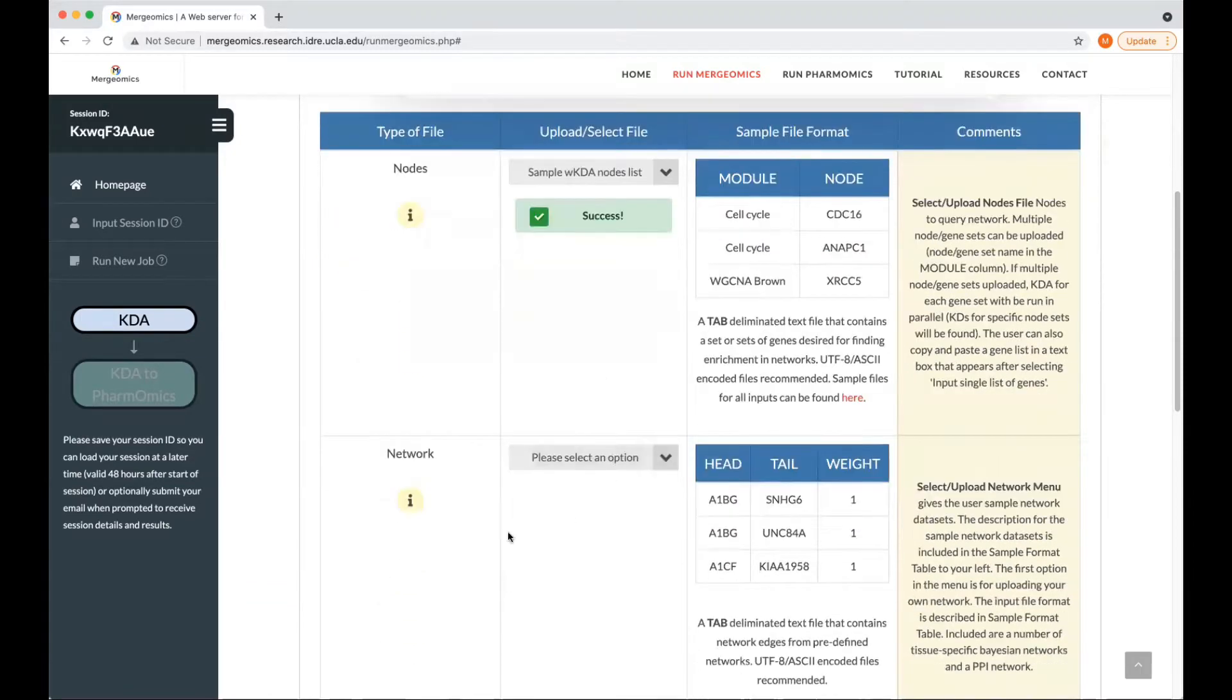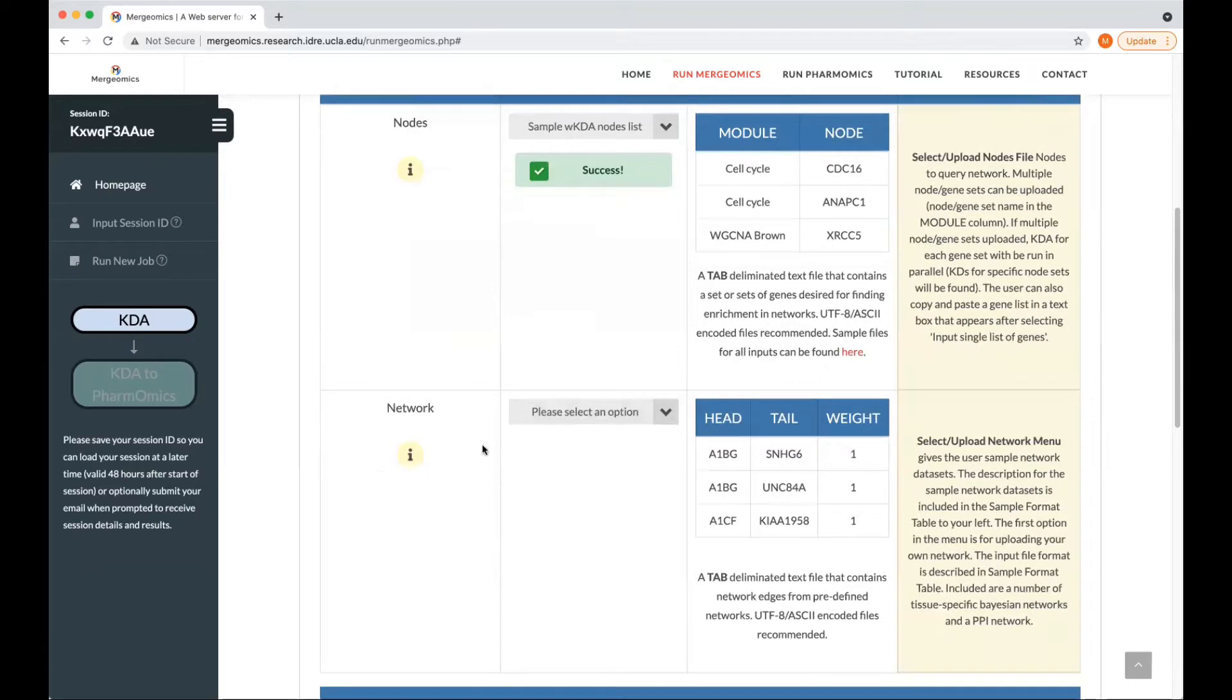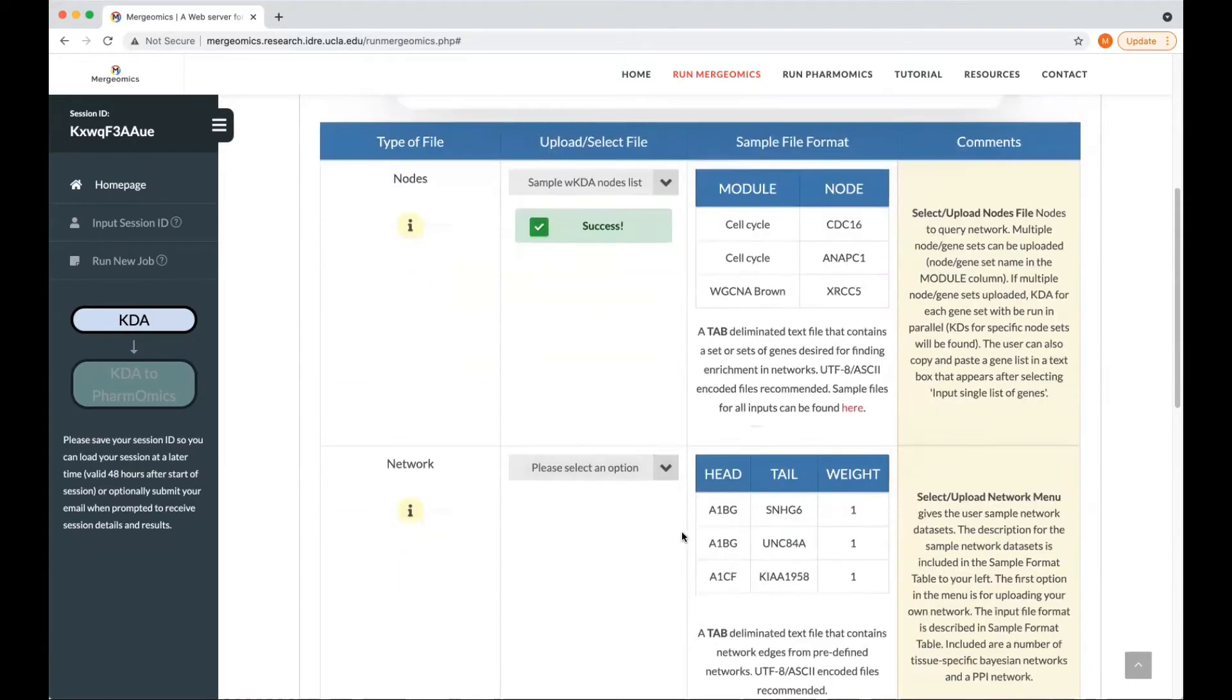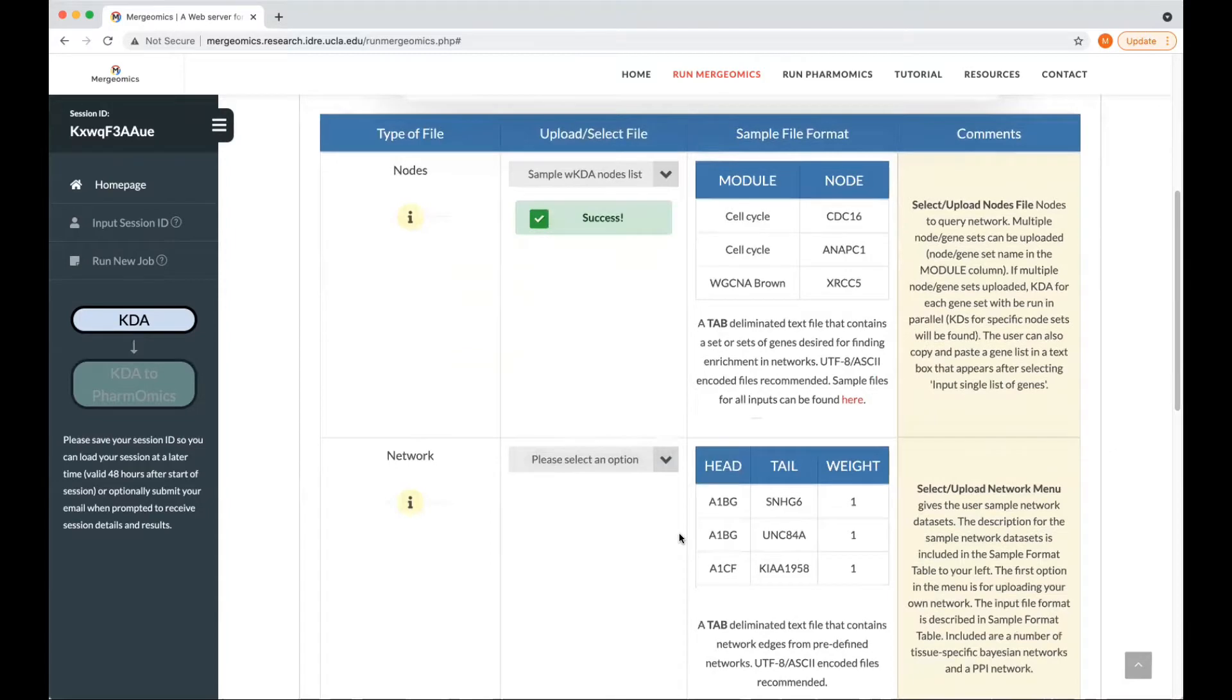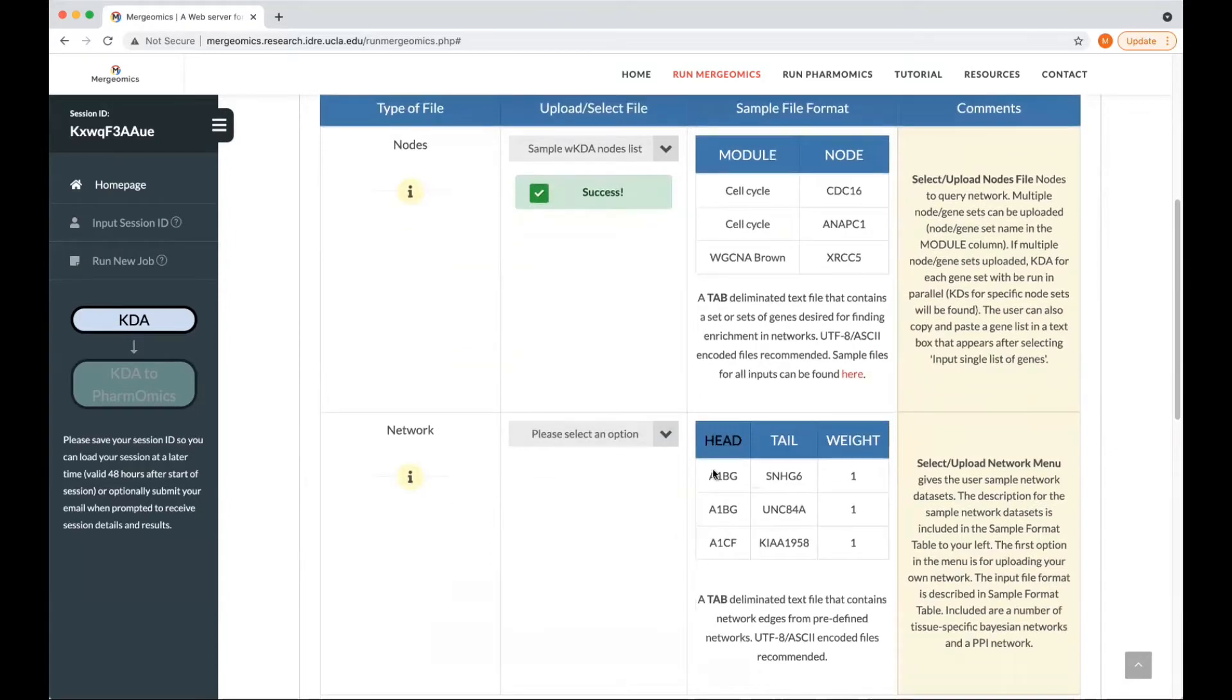The second file that you can upload or select is the network file, where again, if you are to upload your own file, you must ensure to follow the sample file format, where you will have three columns with the headers head, tail and weight.